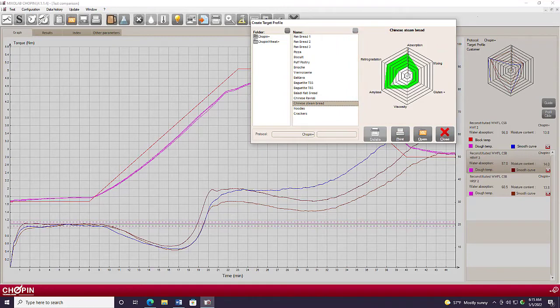And you can see on these six indices on the spider graph, we have this green region where if our flour falls in that region, it's considered ideal or optimal for our process for our steam breads. What we're seeing here are these spider graphs for these three particular flours. And if we look closely, we see that this orange curve fits this green profile more closely. And for our process and our profile would be considered the more optimal flour compared to the other two. And so for each product and each process that you use, you can develop your own optimal profile that you can then use to communicate back and forth with your Miller.